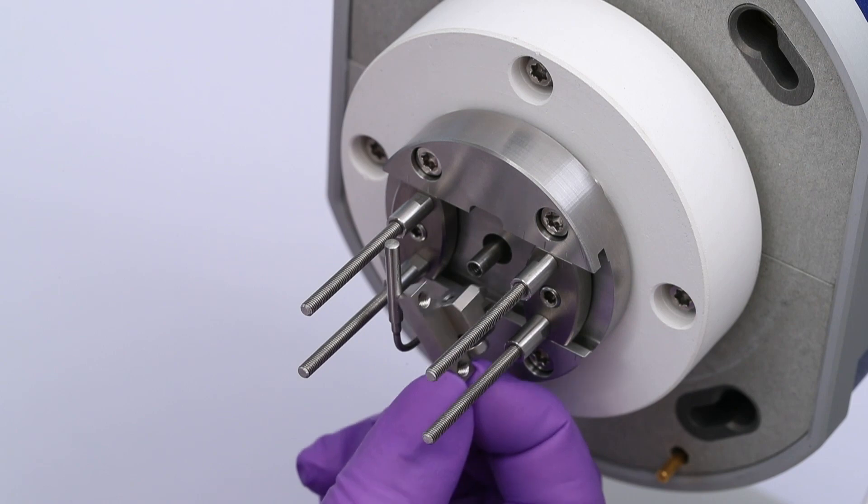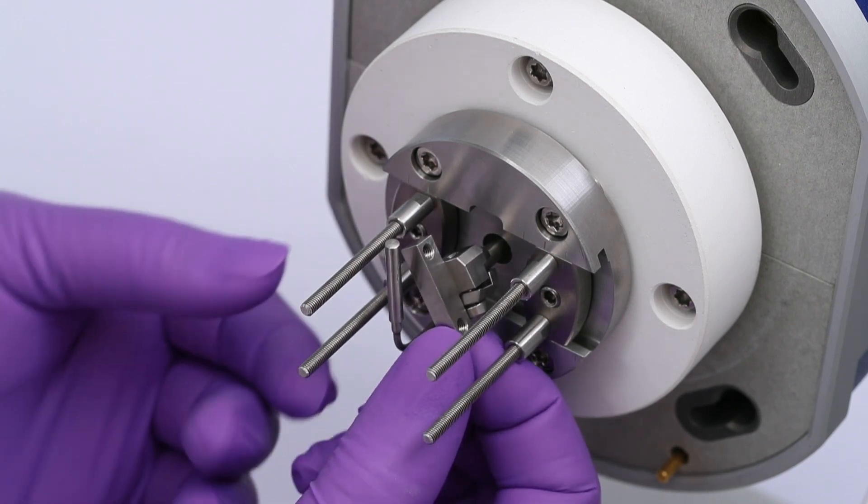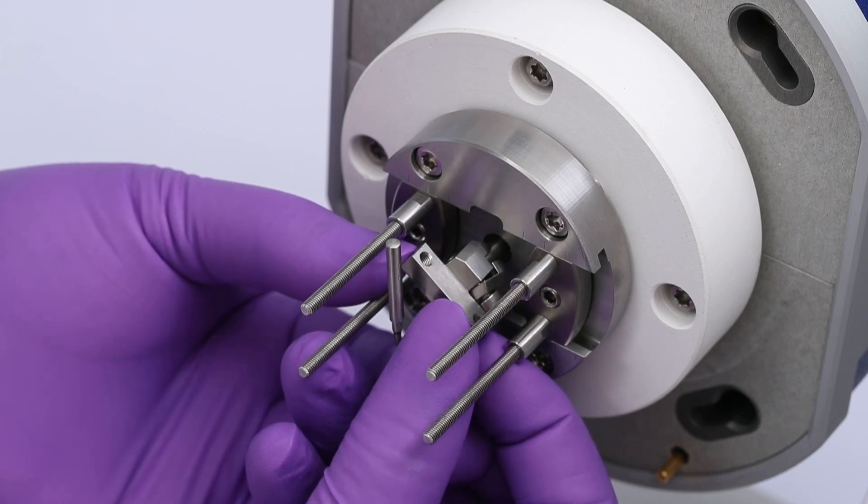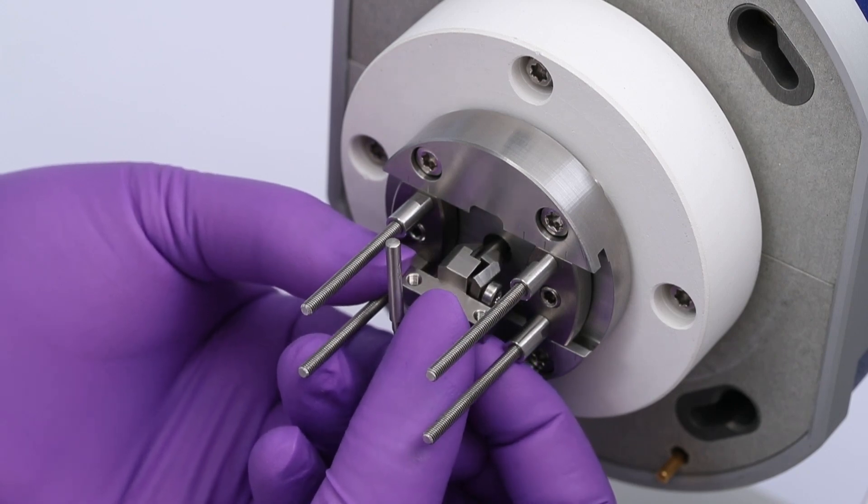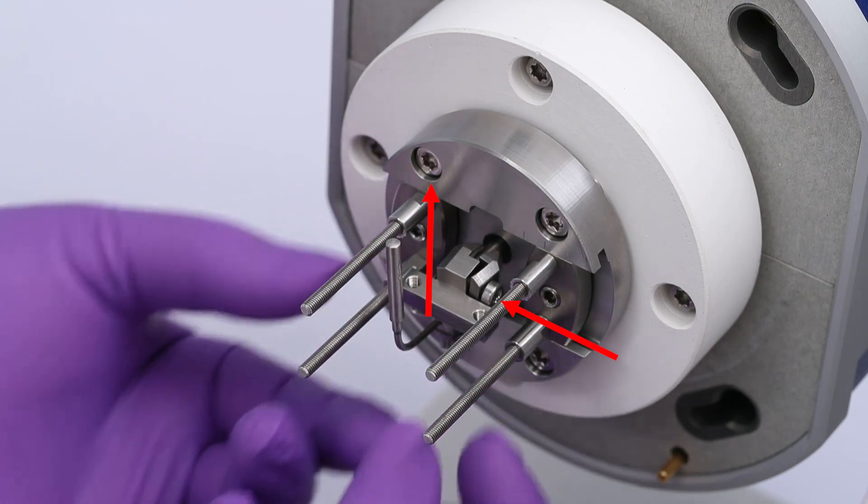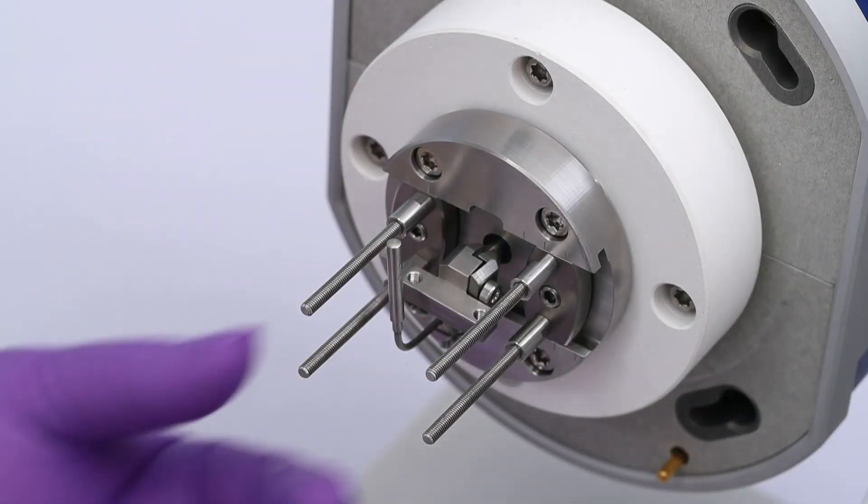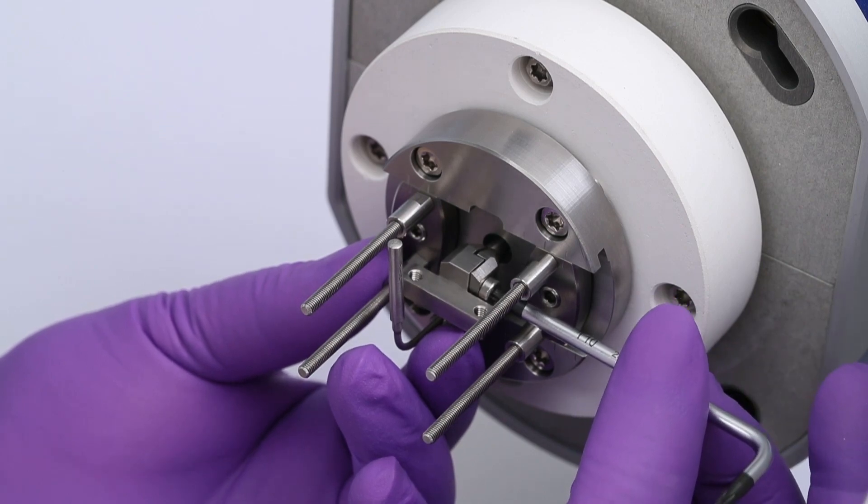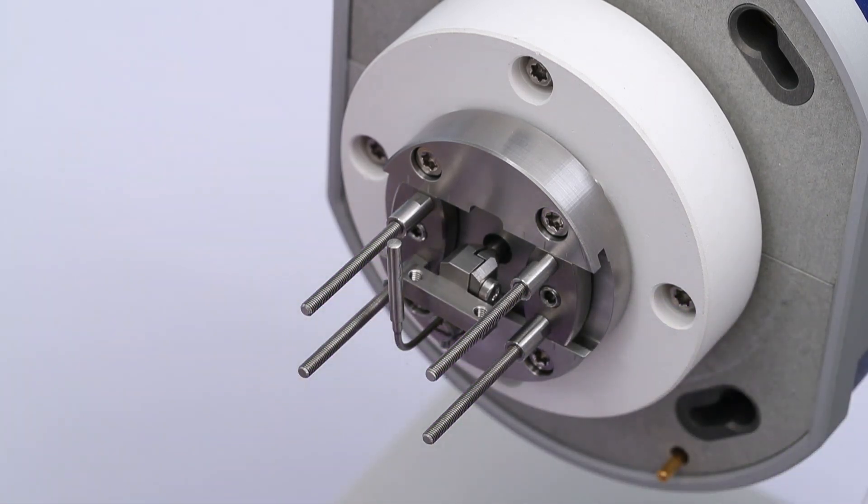Carefully fit the tension clamp onto the drive shaft. Ensure the securing screw is facing towards the right, such that the clamping surface is facing upwards. Gently screw on the securing screw using the T10 Torx key to fix the clamp part, but do not tighten.